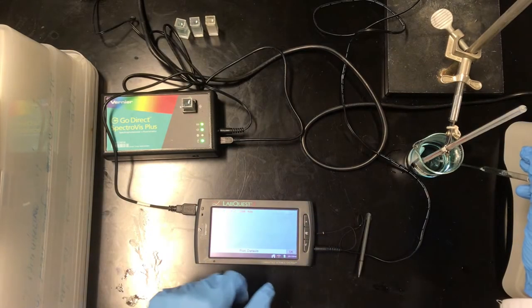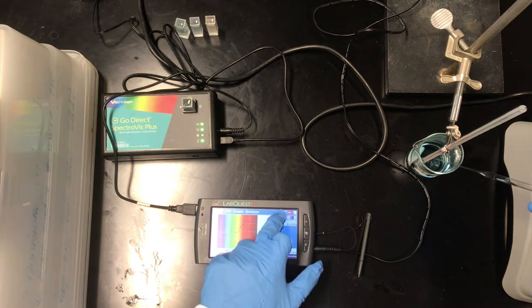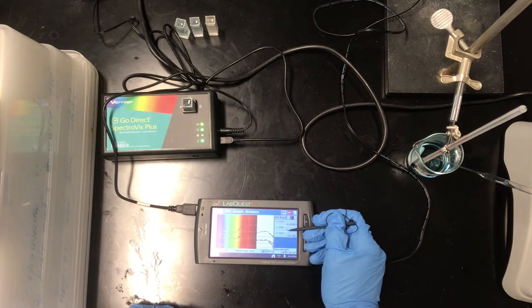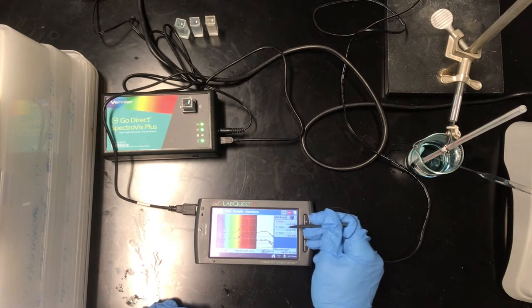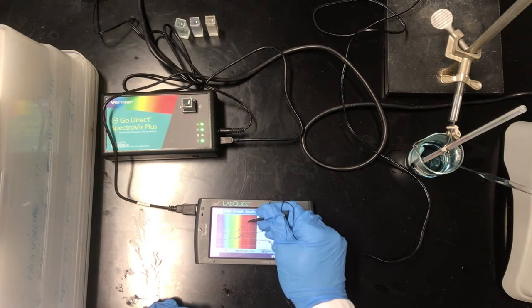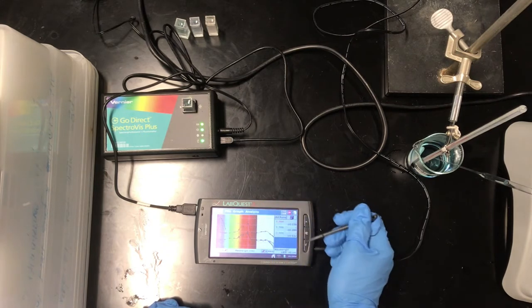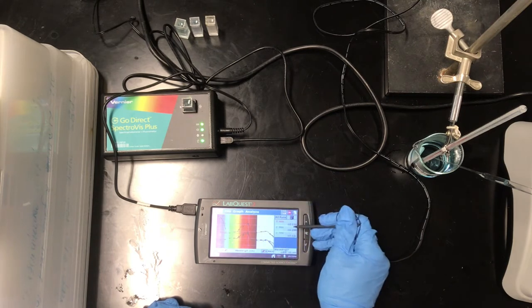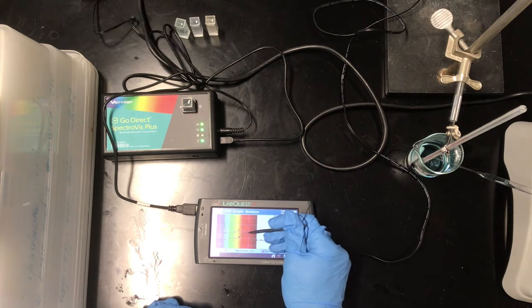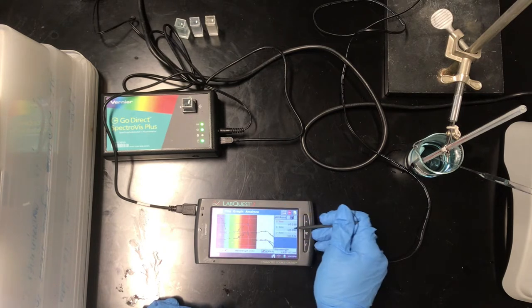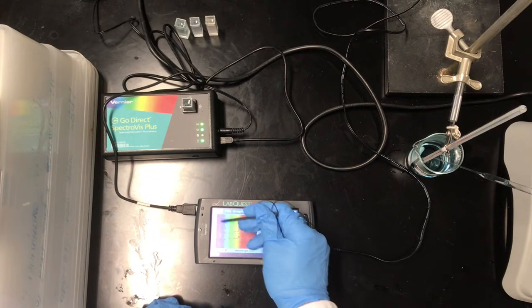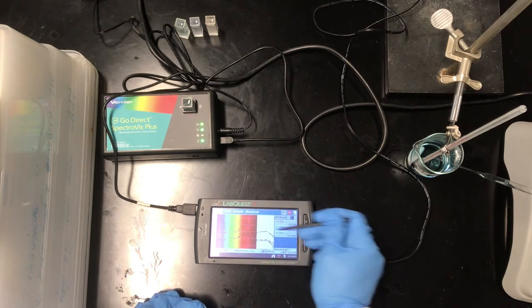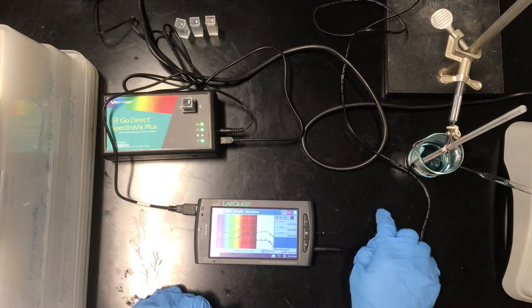So if we display all runs here now, we can get a sense of the difference here. And run 2 is actually a problematic run that I did earlier, so ignore run 2. Runs 3 and 1, you can see run 3 has a bit of a decreased absorbance in this key region, this key orange region, and that huge peak in the purple region has completely disappeared. So I think we should actually ignore this, and we should really focus on this absorbance around 697 nanometers.